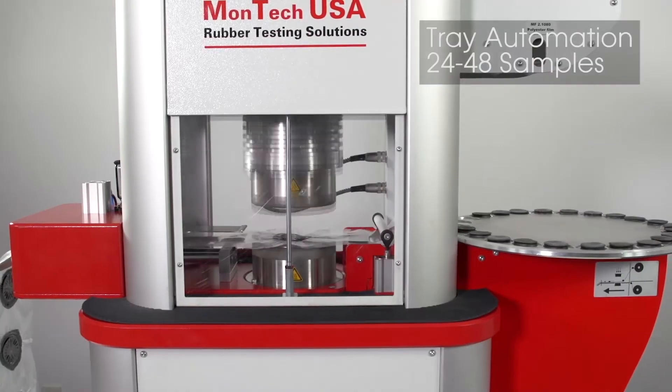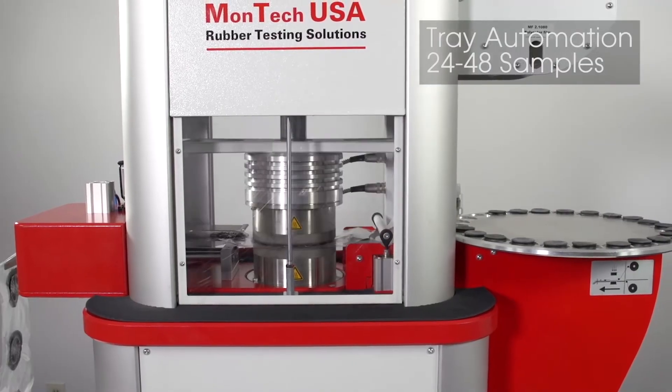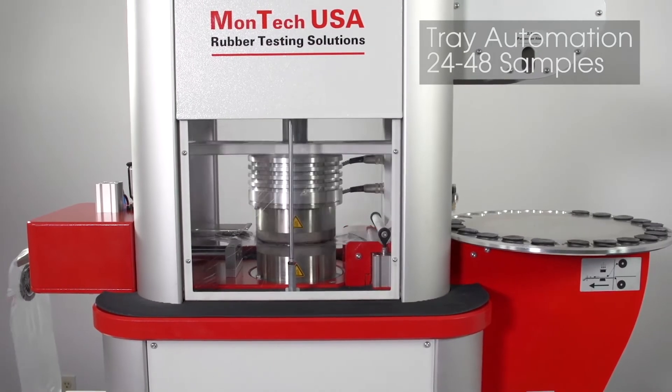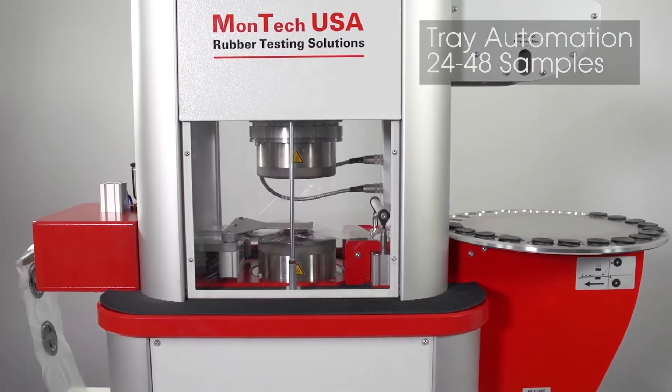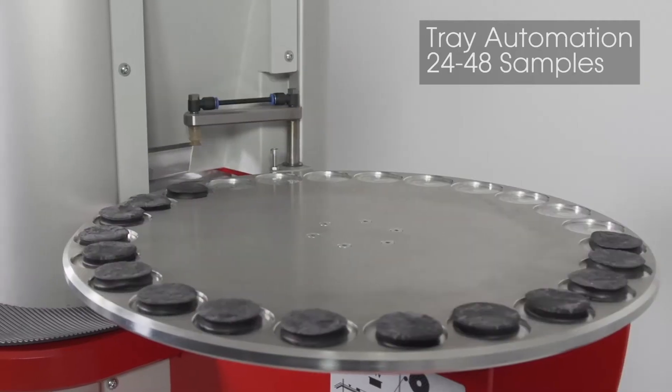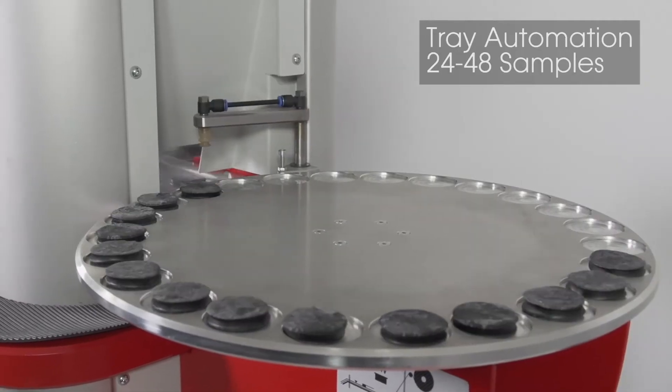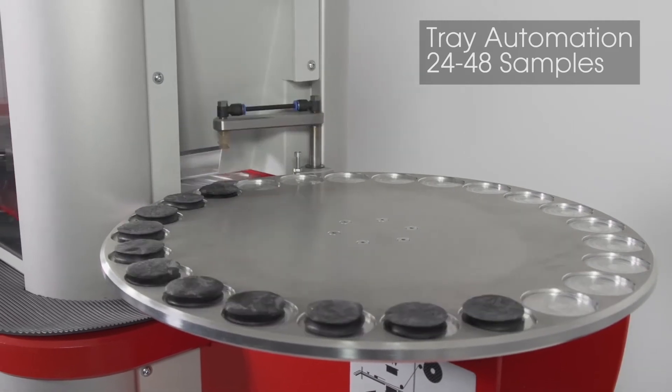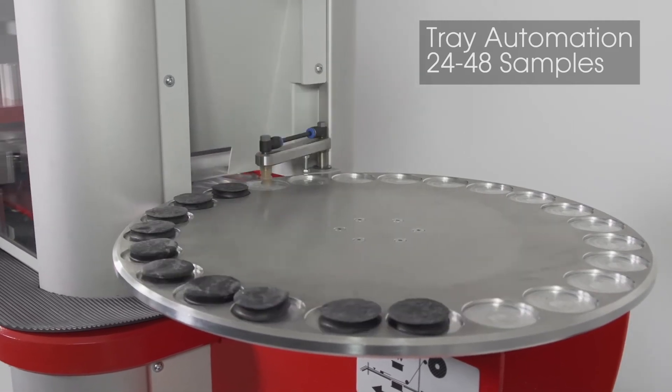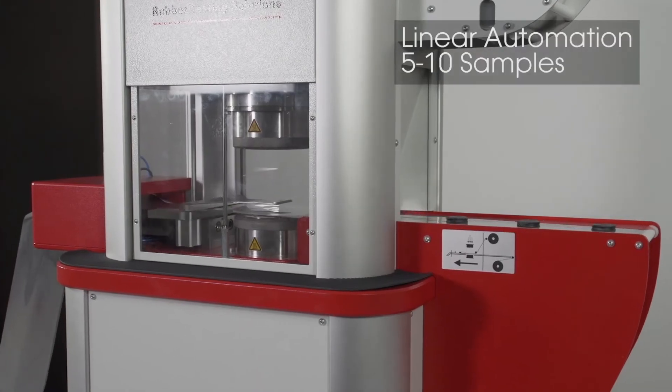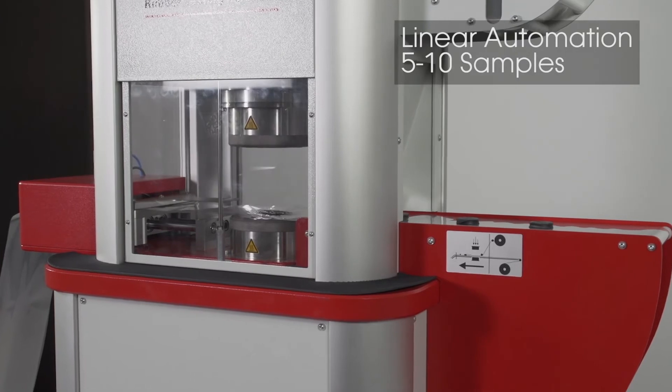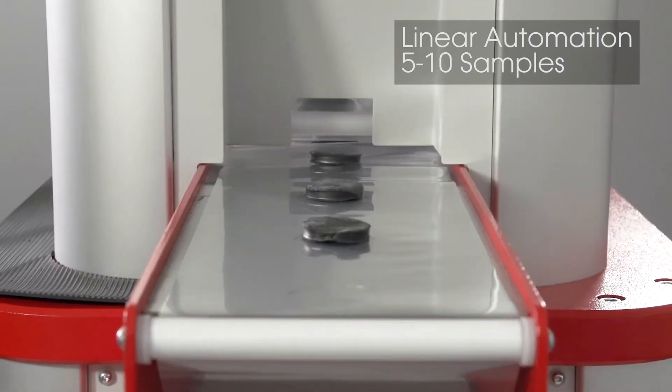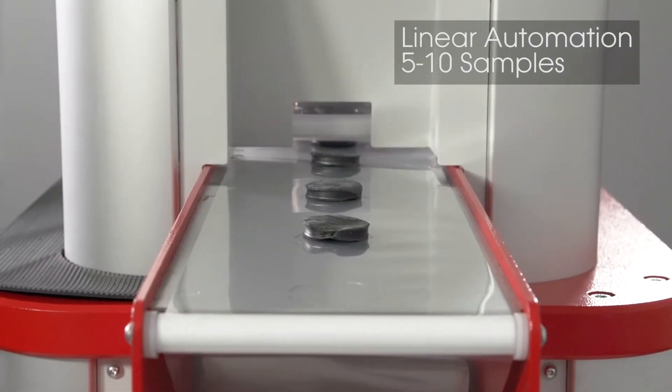There are two primary automation features that can be installed on the MDR3000 Basic. The first is the tray automation, which can accommodate 24 or 48 samples. Second, the linear automation can accommodate 5 or 10 samples fed directly into the machine.